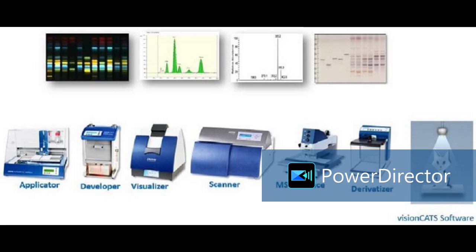These are books and literature available for HPTLC plant drug analysis by Wagner, and in toxicology also there is one book that is like a Bible. In toxicology, we have Narayan Reddy and Pillai. In forensic toxicology, we also have one book. I'll show you that. It is useful for forensic toxicology. You can do a literature survey.